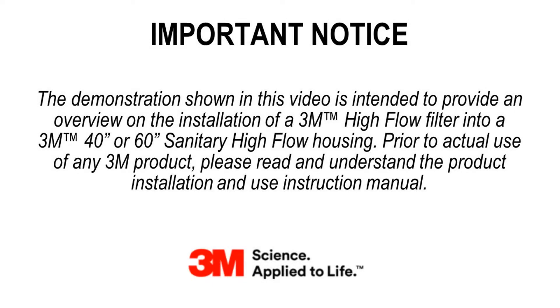The demonstration shown in this video is intended to provide an overview on the installation of a 3M high-flow filter into a 3M 40-inch or 60-inch sanitary high-flow housing. Prior to actual use of any 3M product, please read and understand the Product Installation and Use Instruction Manual.